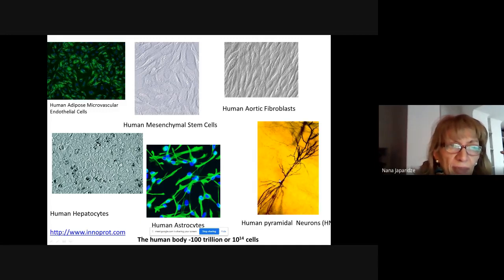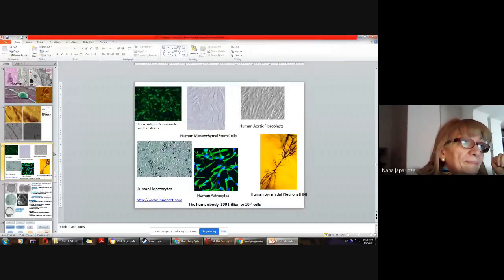So this is the cell body again, triangularly shaped, and these are processes which are not actually visible in the case of hematoxylin or eosin staining.